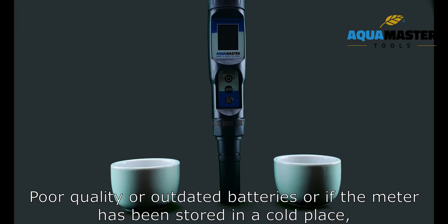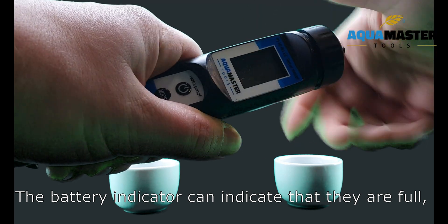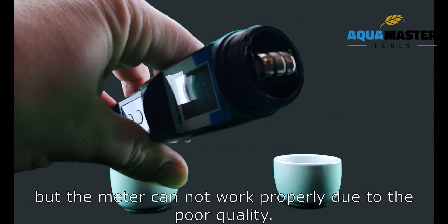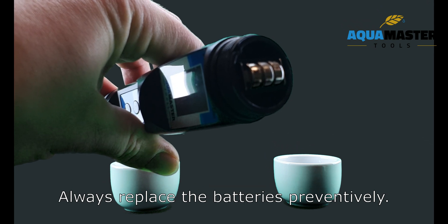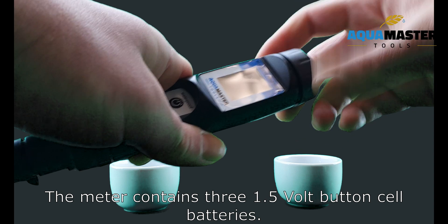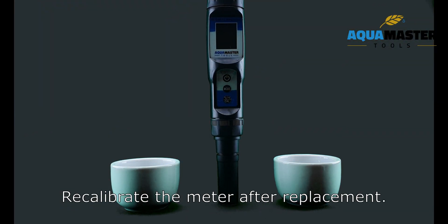Poor quality or outdated batteries, or storing the meter in a cold place, can deteriorate battery quality. The battery indicator can show full, but the meter may not work properly due to poor quality. Always replace the batteries preventively. The meter contains three 1.5 volt batteries, which you can easily replace. Recalibrate the meter after replacement.